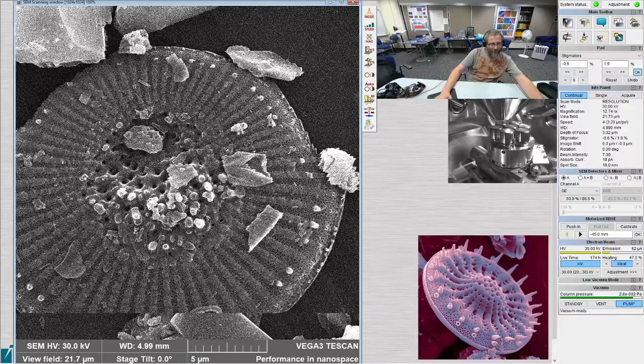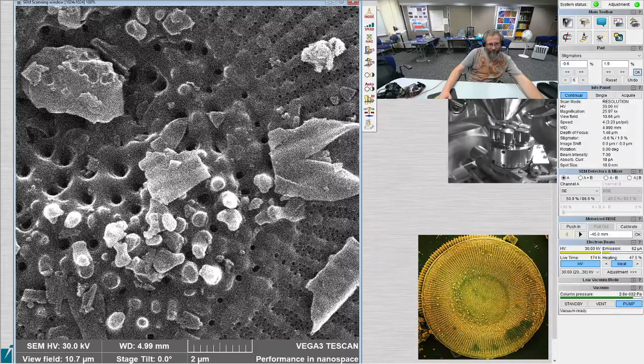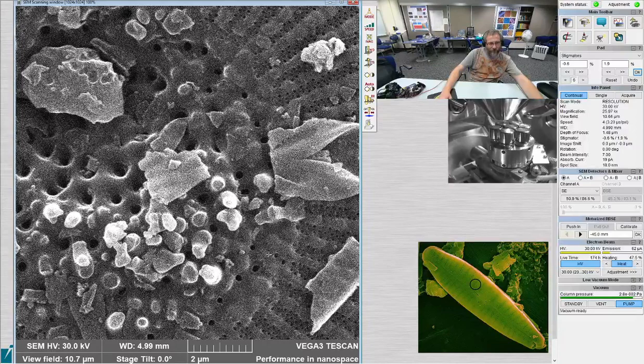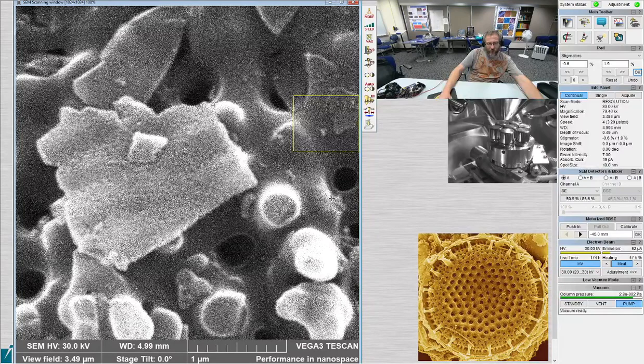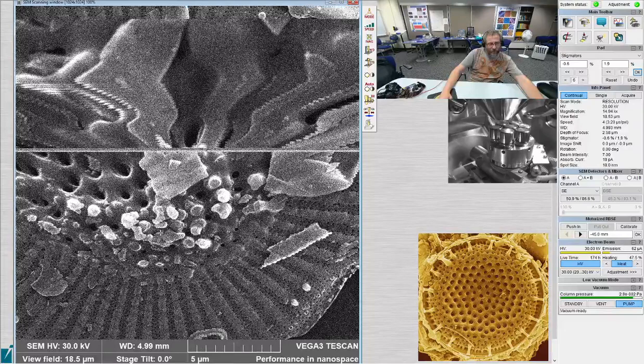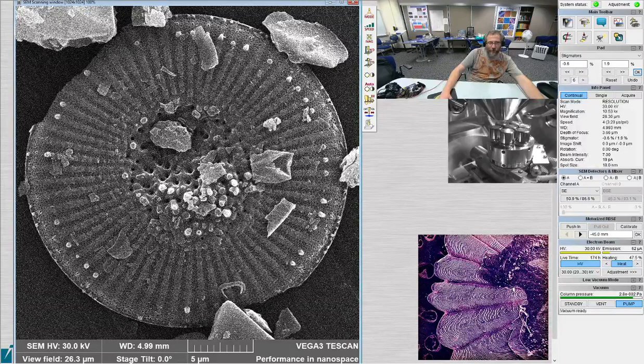Whew. There's some of the nubs. This one's a bigger one. And it also has these nubs on the colliculate part here. And there's some examples of some areoli that are in here among these. Pretty sure they're areoli. That one's a lot bigger. I think it's the same species. So little nub-shaped spines all the way around.